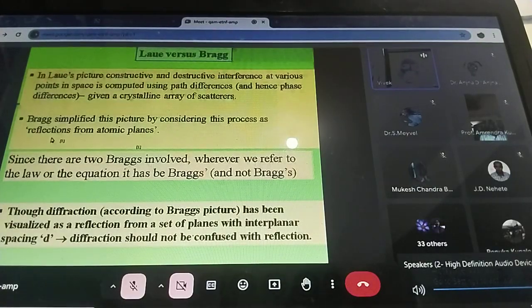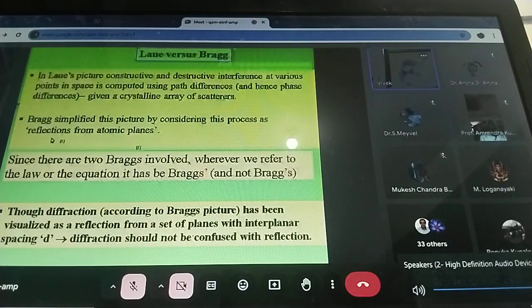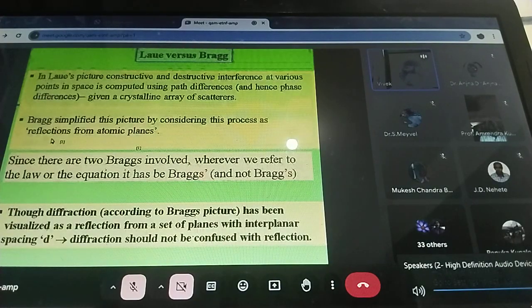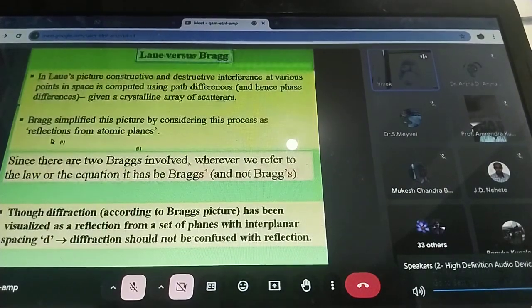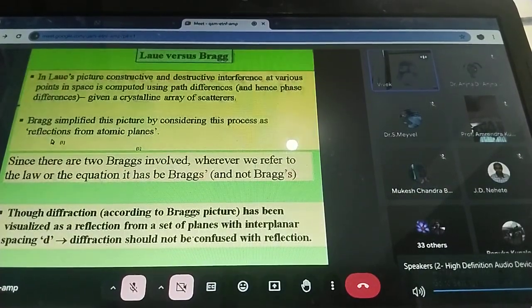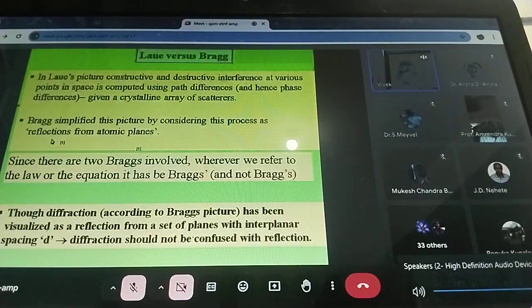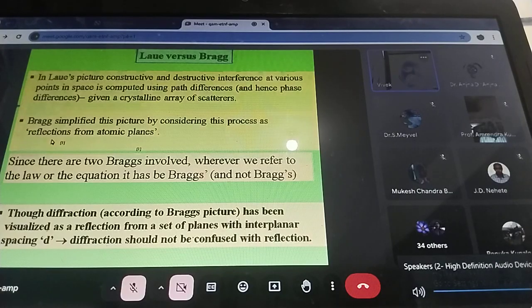You have selected, out of the 14 Bravais lattices, one that is primitive or non-primitive. That you can make out by finding Z. If my Z is coming 1, I will say primitive. If my Z is coming 2, I will say in triclinic it is P1 bar, because in P1 bar one atom is generated by applying the inversion symmetry. So then I calculate how many Z are present. For this I will do a simple density experiment.